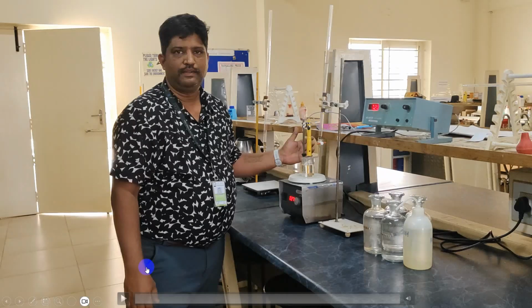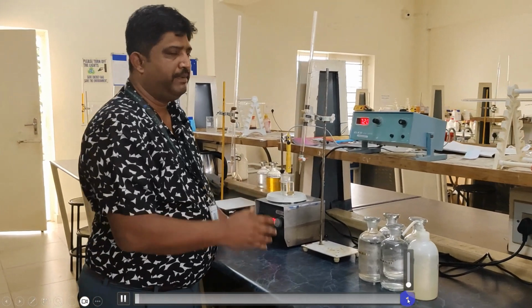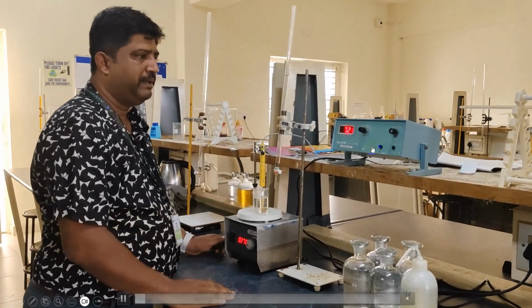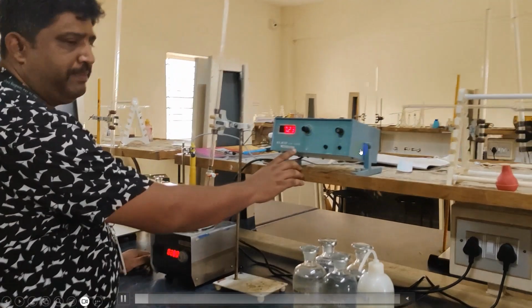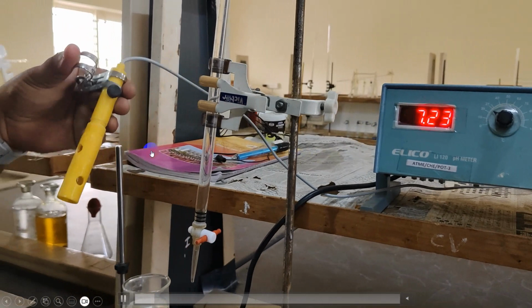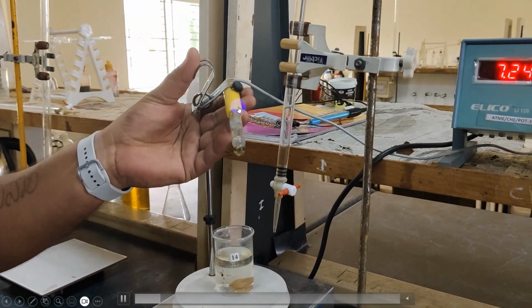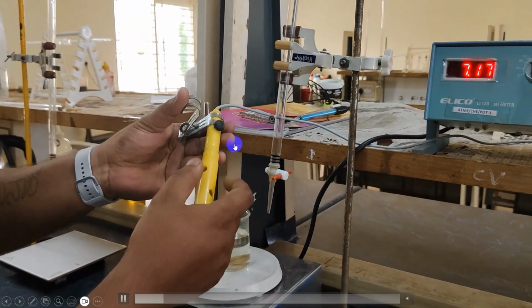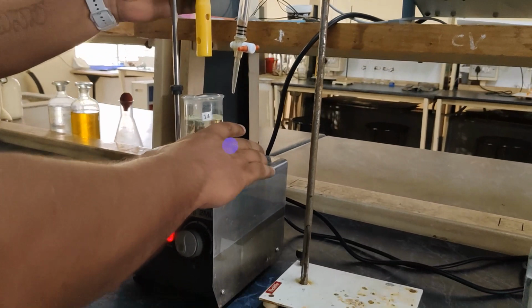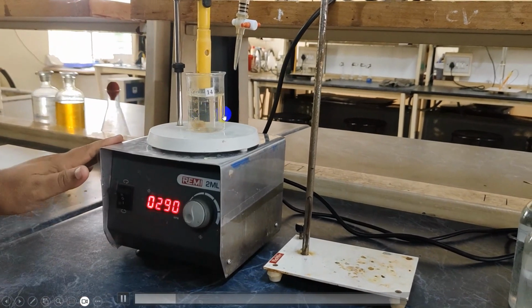Let us see how we perform the experiment. So this is the experimental setup we are having. So this is the pH meter. You can clearly see the pH meter here. The pH meter measures the pH of the solution, and we will be having a combined glass electrode. So a glass electrode combined with the reference mercury chloride, that is the calomel electrode. The electrode will be immersed in the solution. At present, we have only distilled water here.